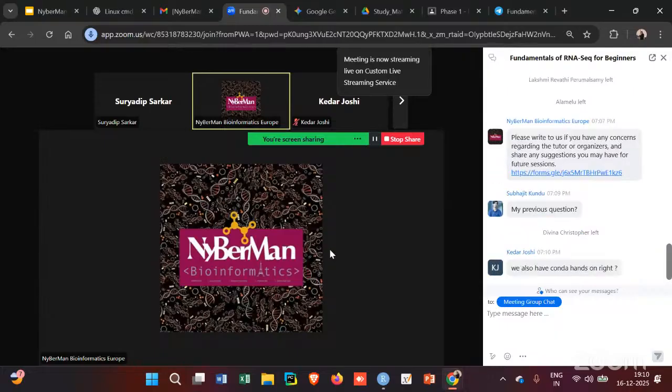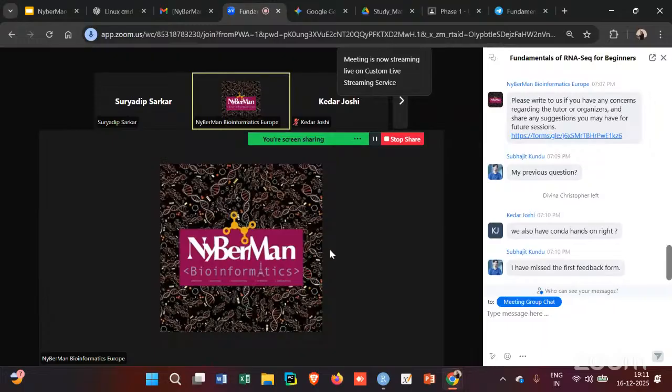And okay, with that said, you have Conda hands-on. Anyway, when we'll be using the tools, we'll be using Conda. So after you're done with the installations, we will use Conda. So that is also something that we'll do.